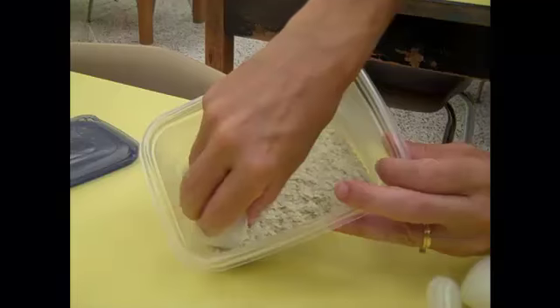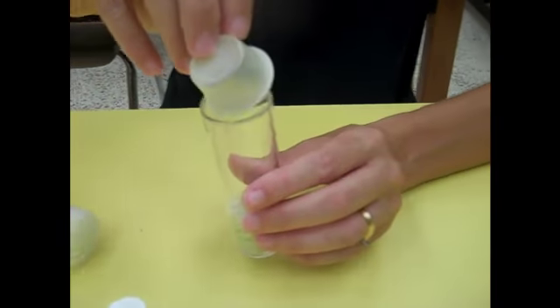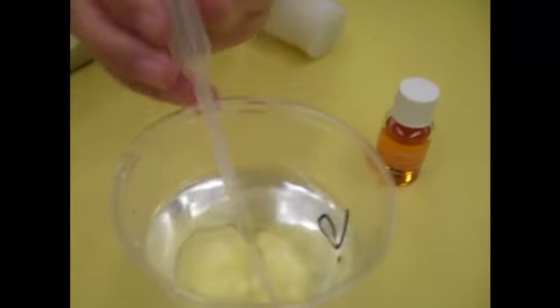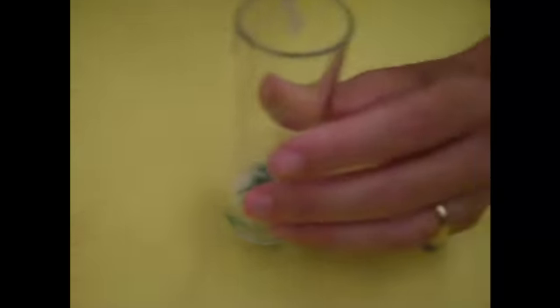The first thing you need is some food. The food comes at first in this dry powder form, and you just get a scoop and pour it in. And then you're going to get water in it, and sometimes it's hard to get the bottom thoroughly wet, so you want to jet the water in there a little bit so that it sinks down into the bottom layers of the powder.